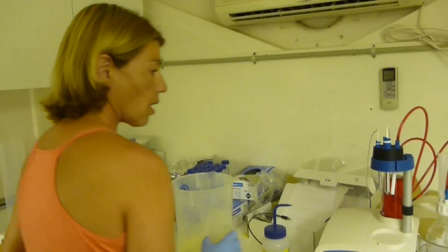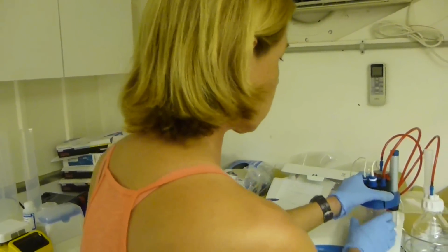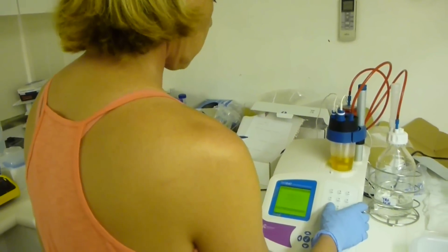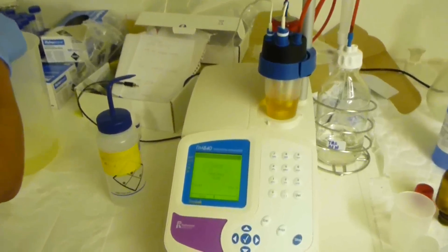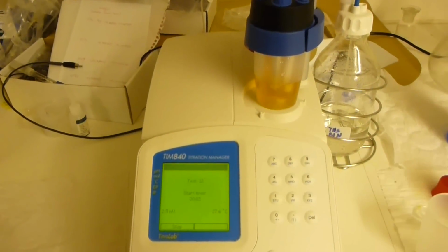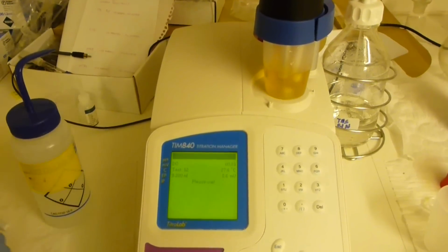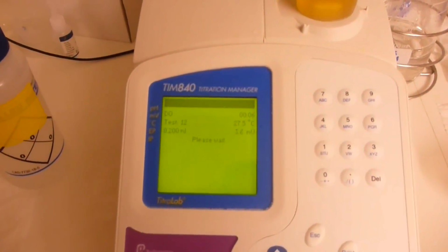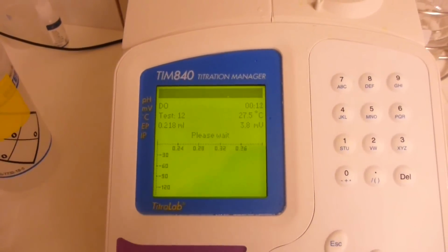So I think it's an all-automatic titration. Now I change the sample and put it in, and start again. One of them is quite high. This might be the control over here, either this one or that one. Jack, did you do the incubation on it? No, we didn't collect it. We just took it from last night's samples. What I actually write down is the amount of thiosulfate solution that is in the bottle, and then I calculate the amount of dissolved oxygen in the sample.